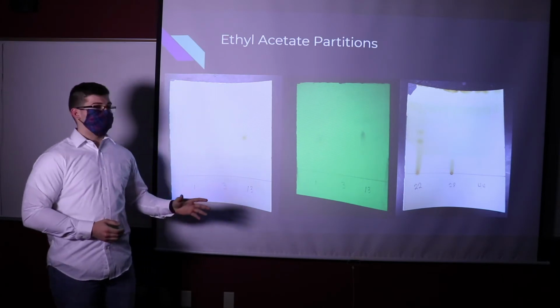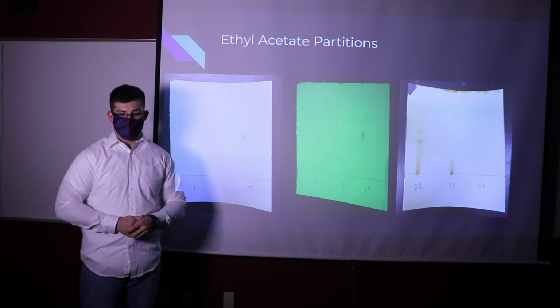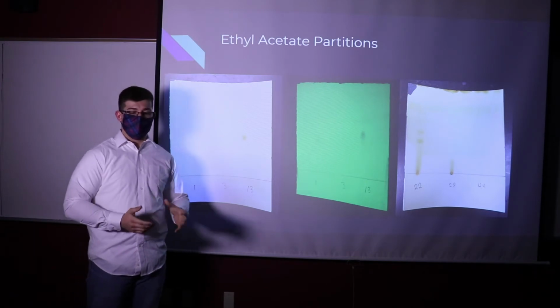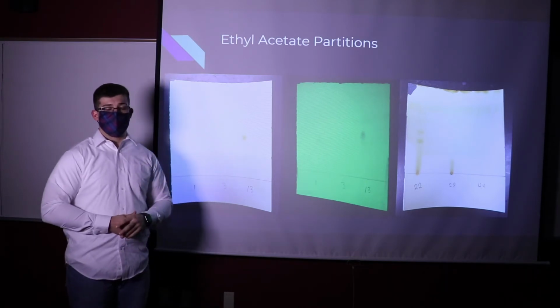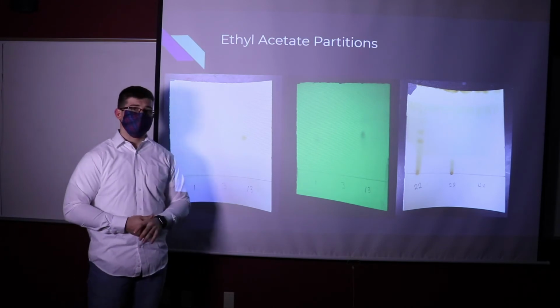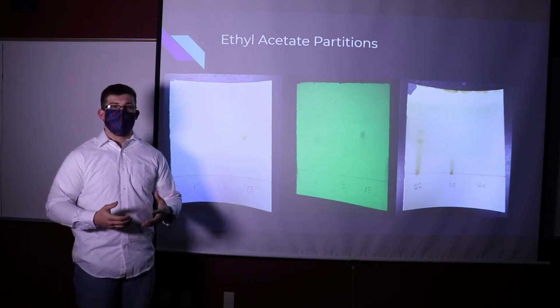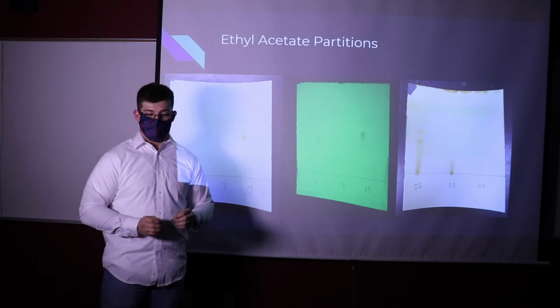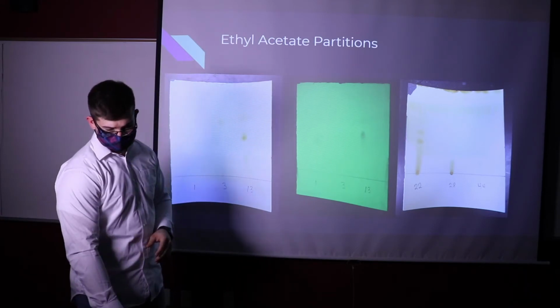These are some of the TLC plates that I was able to develop from the ethyl acetate partition. Specifically, we went forward with the ethyl acetate partition because, as you can see from these plates, these showed pretty solid separation and allowed for us to be able to try to isolate specific compounds from this for further investigation.